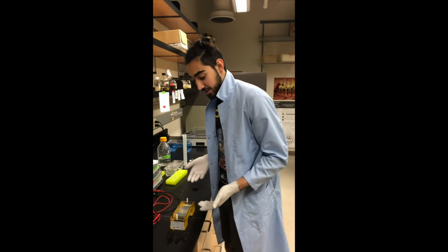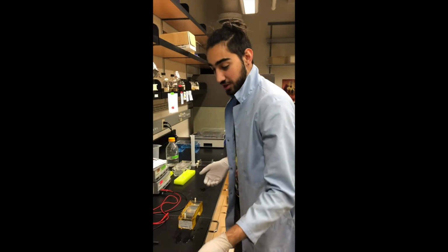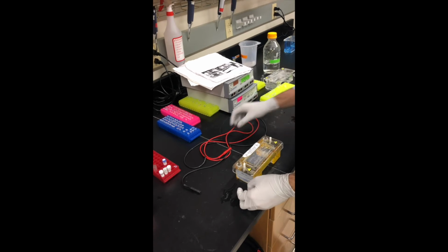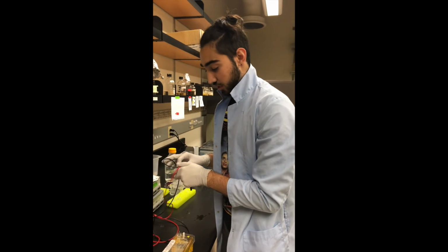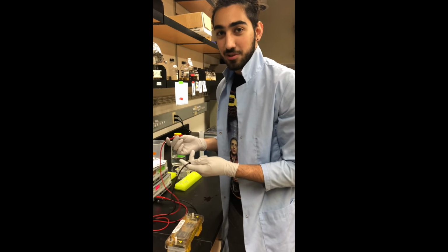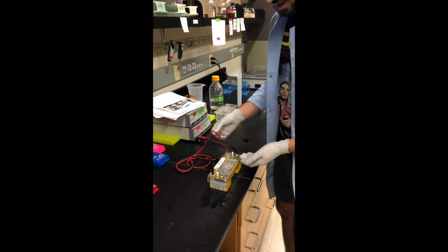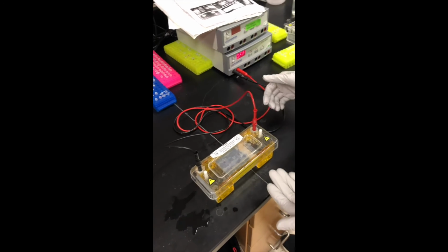Alright, so now that we have our samples and our ladders pipetted into the wells of the gel, what we're going to do is we're going to have to put the lid on, of course. And since DNA is negatively charged, we're going to run it towards a positive charge. And the classic way to remember this lingo is run to red. So you have your black side on the side where your samples are, and you put the red on the other side, and we're gonna run to red.